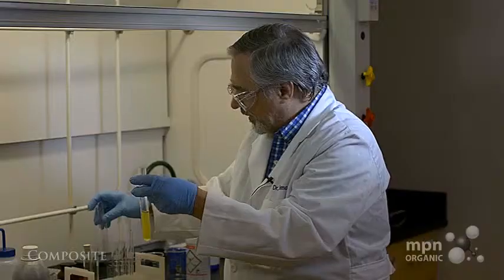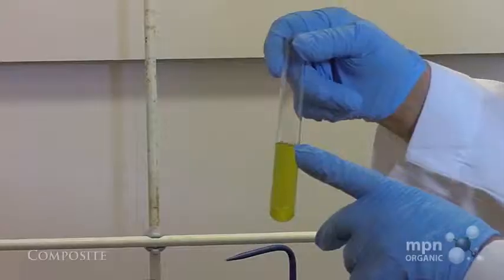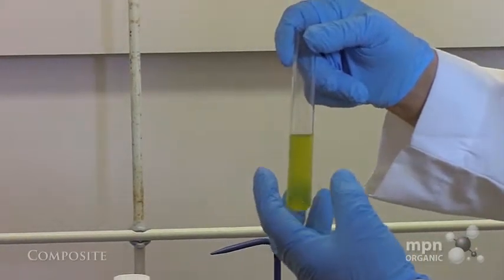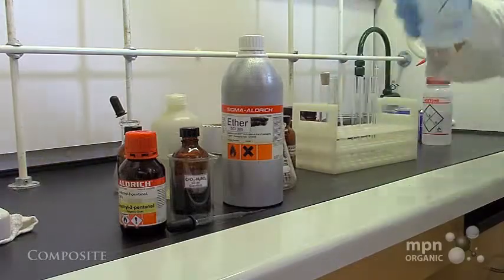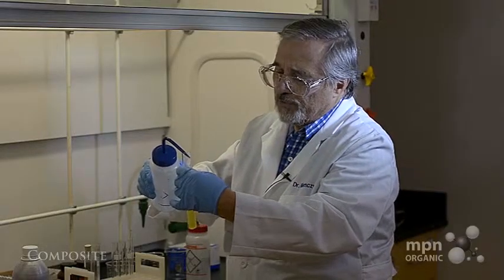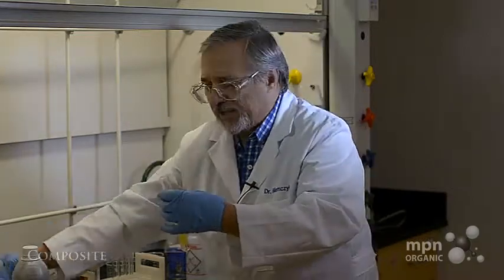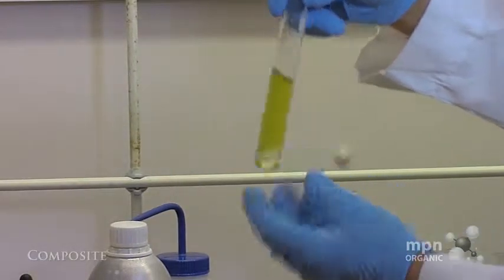Like that. Okay. Now, remember, this has acetone in it. It also has a little bit of water, and it has the compound. So what we're going to do then is to wash it a couple of times with water to remove as much of the water-soluble stuff that just got mechanically carried over and was solubilized in the diethyl ether.